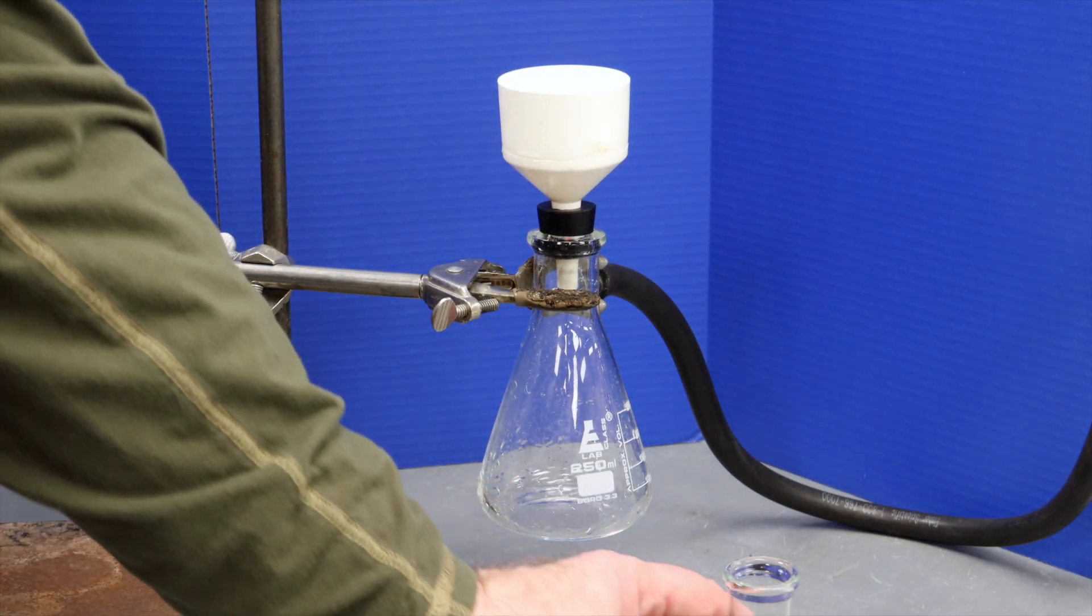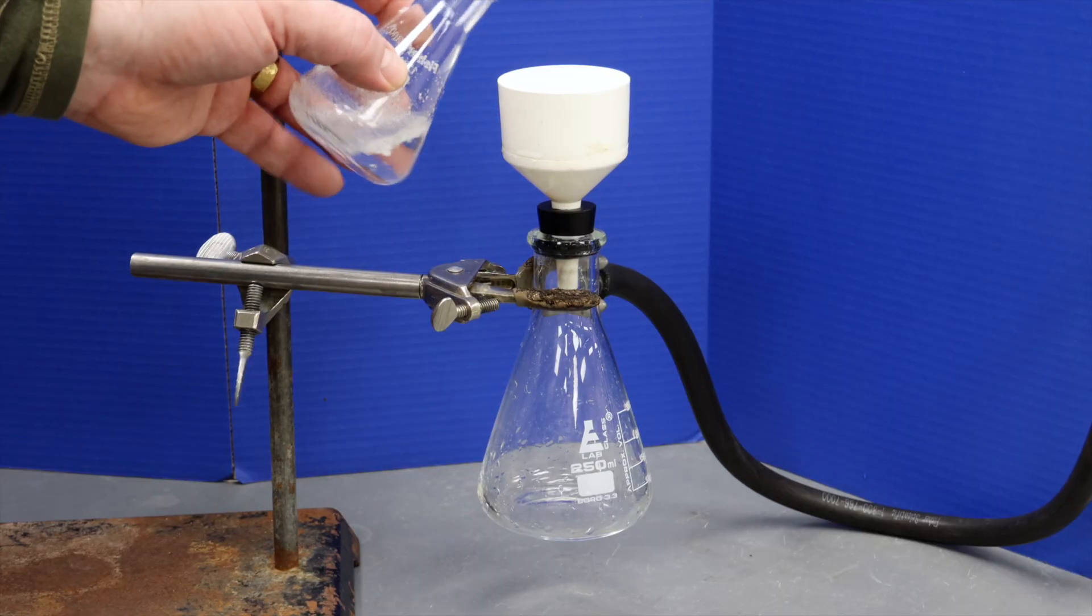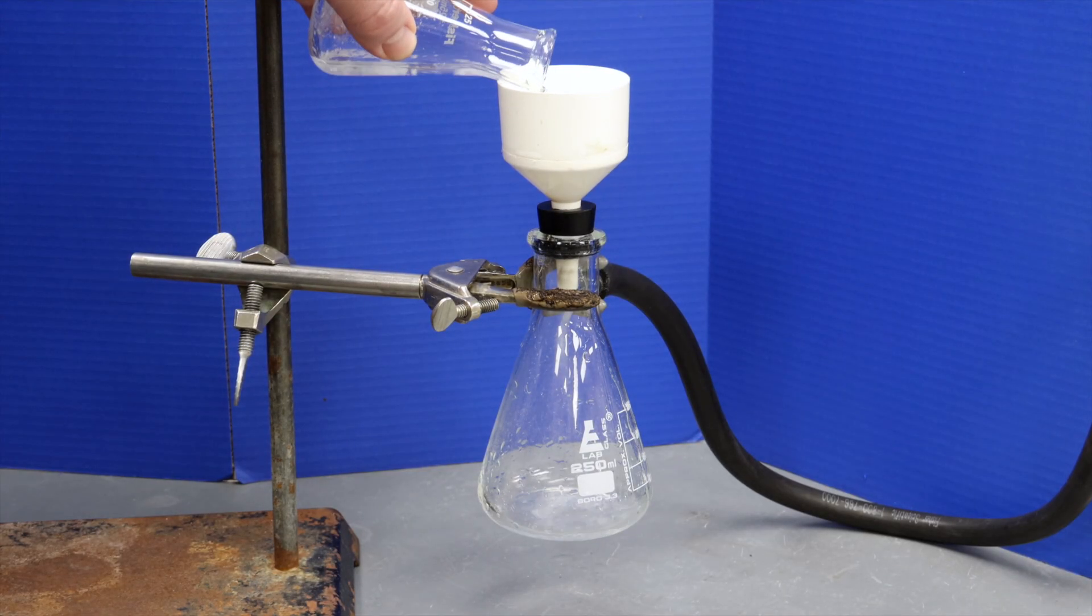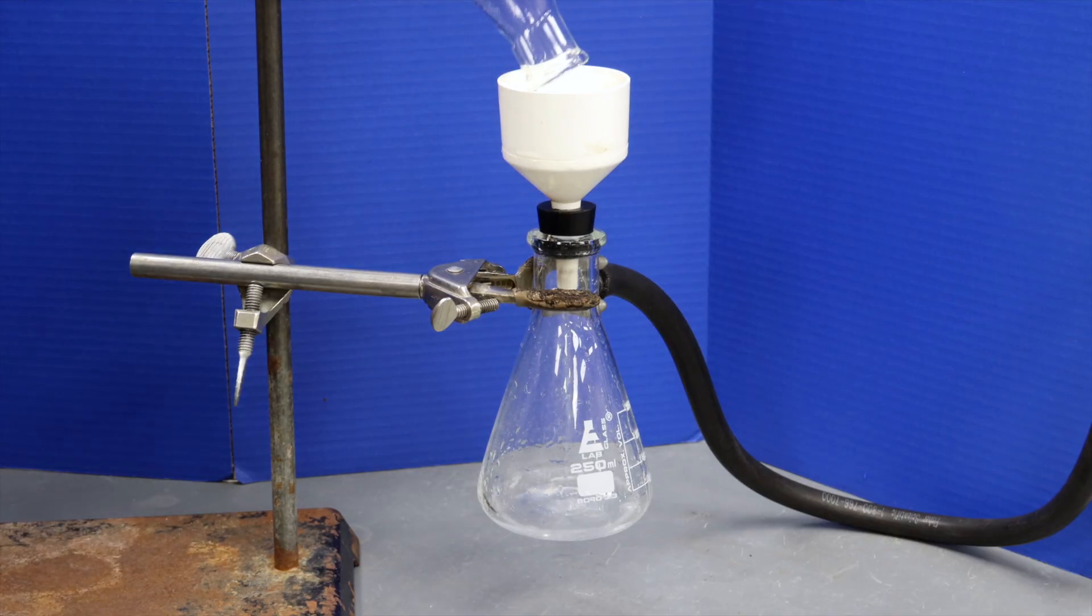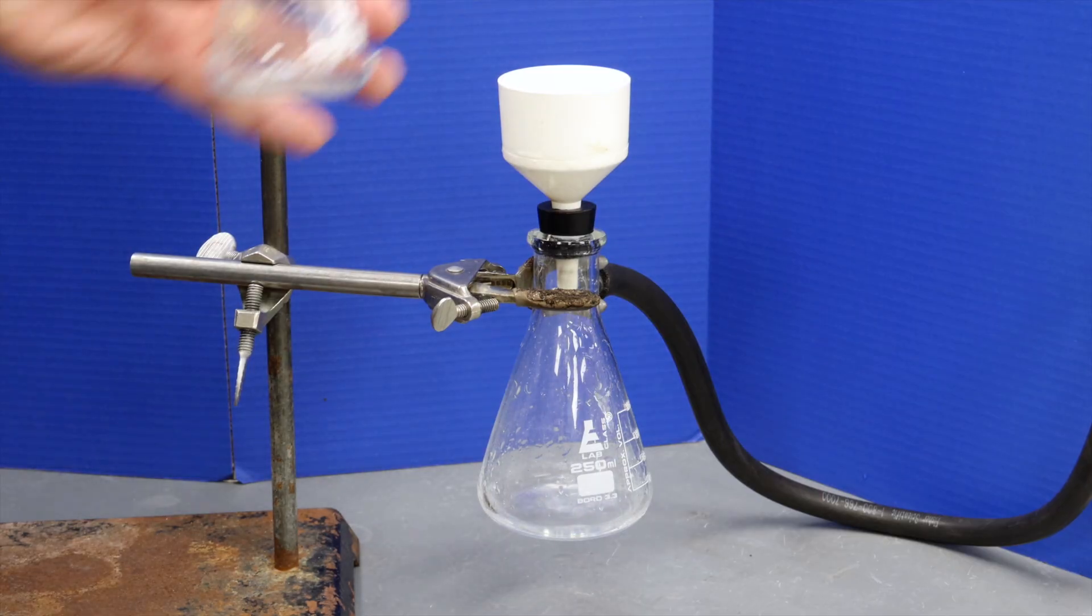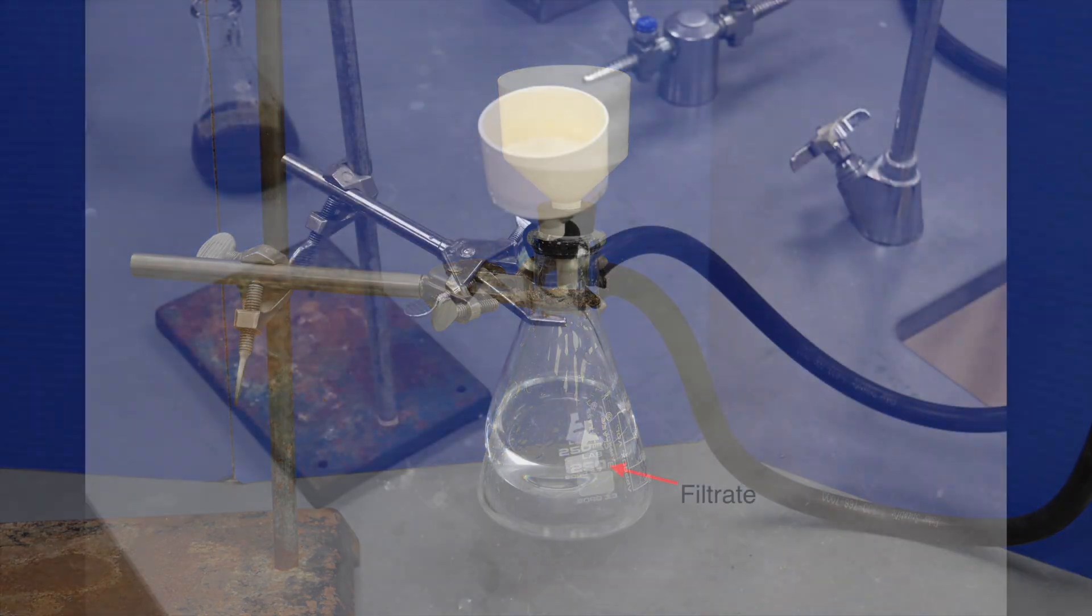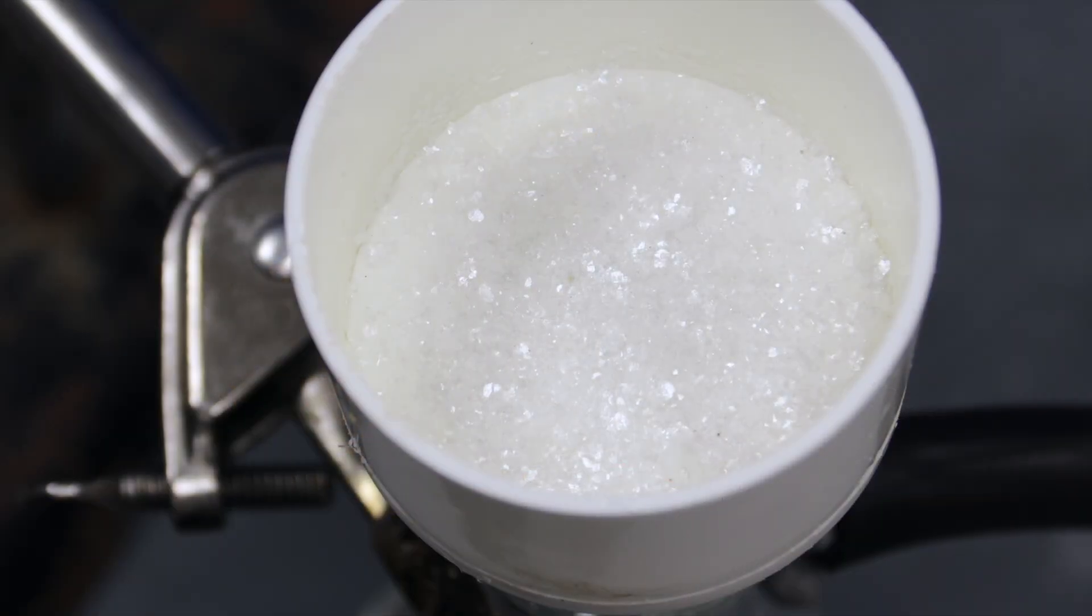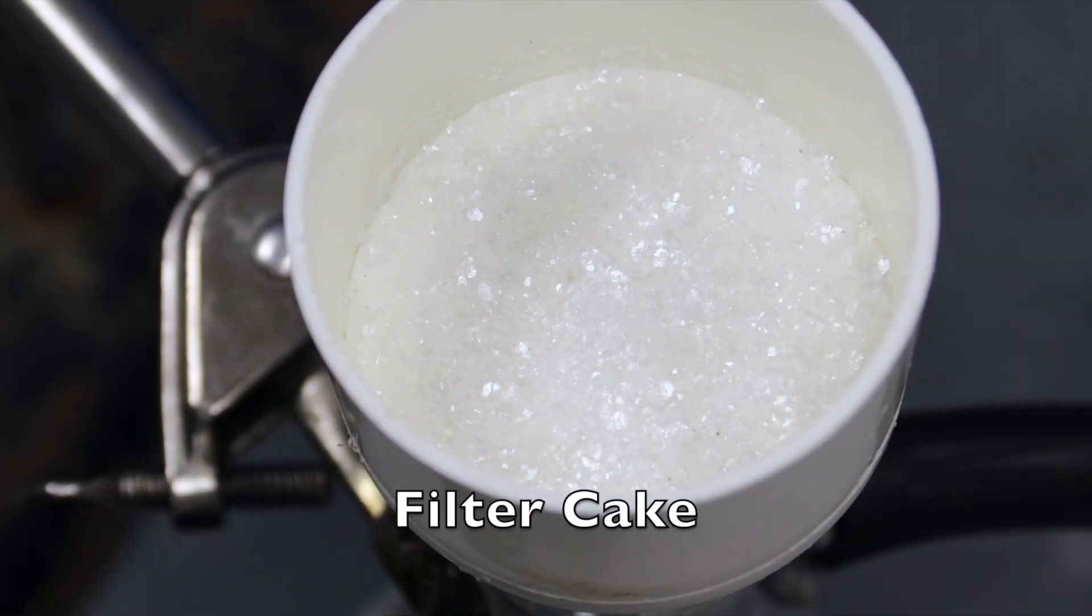Once you are confident that your filter paper is ready to go, carefully pour your mixture through the Buechner funnel. The liquid will be drawn through the filter paper and into the vacuum flask. We refer to the liquid that passes through the filter as the filtrate. The solid material in your mixture should remain on the filter paper. The solid on the filter paper is called the filter cake.